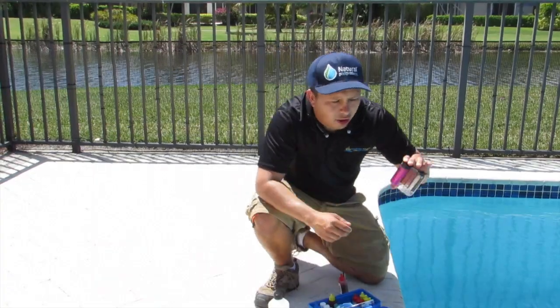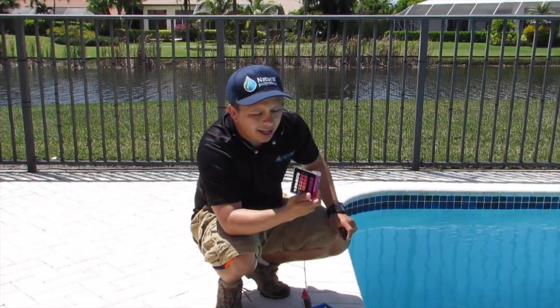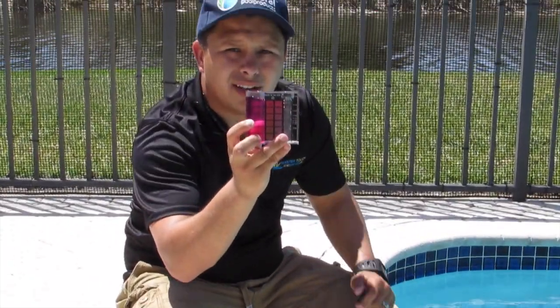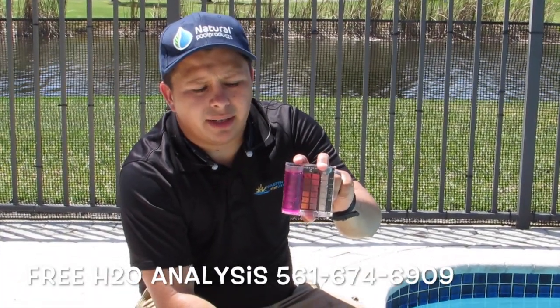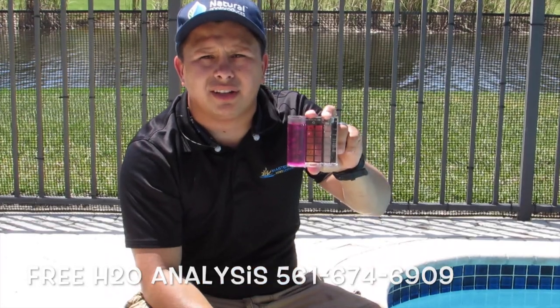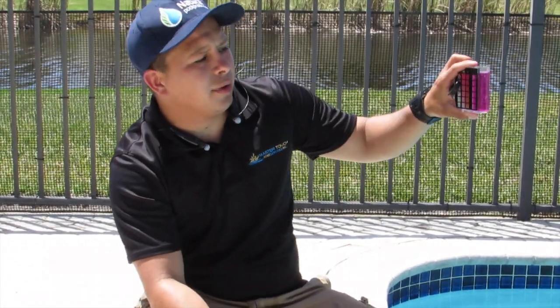We add bicarb on our test alkalinity. Right now, if you look at it, pH is at 8.0 — it's really pink. Why is that? Before we tested it, we added bicarb to boost it up so you can actually see the color through the video. Right now it's at 8.0, and you want to make sure it's at 7.2.